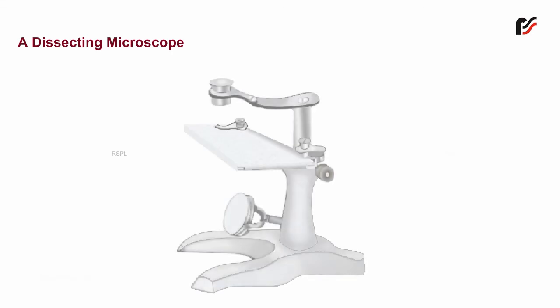Dissecting microscope. A dissecting microscope is used to see large sections, to magnify small living or dead organisms, and to perform dissections by obtaining a magnified image through it. It is considered a simple microscope because its folded arm consists of only one simple convex lens.